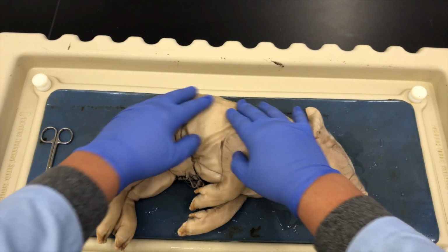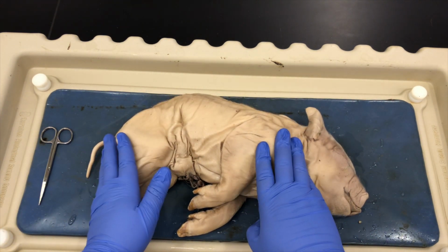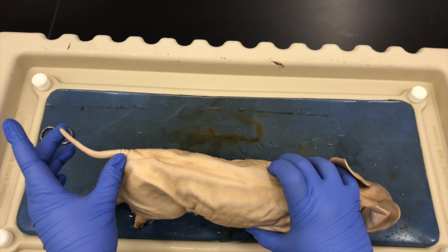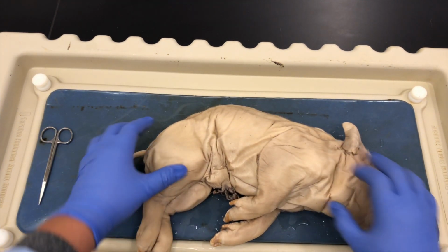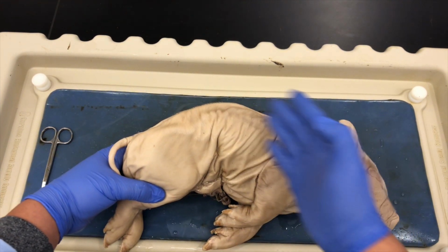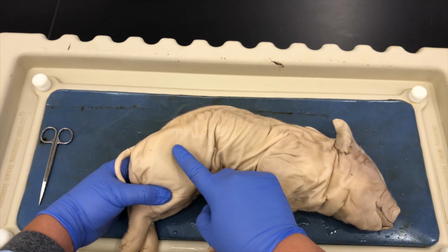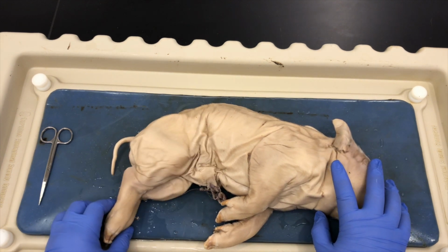Here is the trunk of the fetal pig. Next we can see its tail. The trunk of the fetal pig begins at the end of the neck all the way to the beginning of the tail. The thorax begins at the end of the neck and ends at the end of the forelimbs, and the abdomen begins at the end of the forelimbs all the way to the beginning of the tail.